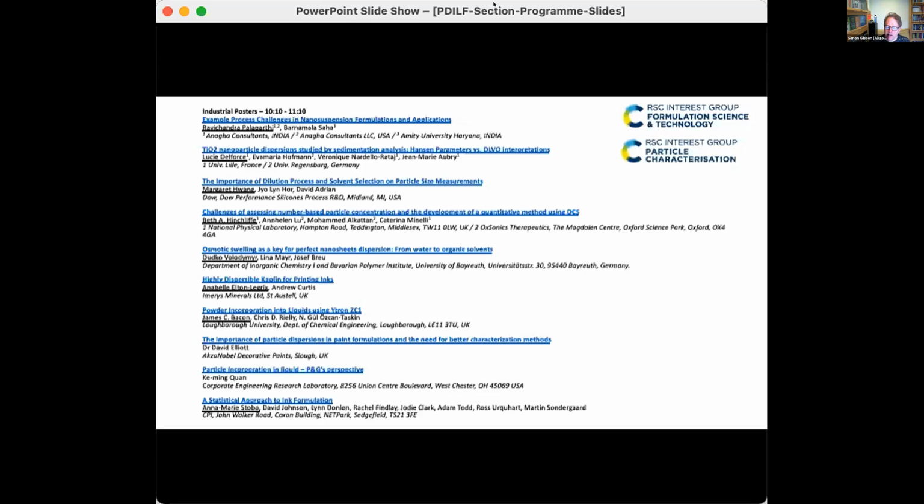Yeah, I can understand that a small number of particles of small size, which would show up in a number distribution, could have significant safety implications, which could be quite interesting. We managed to get a patent once where we stated that it had to have a number of particles below a certain size. All that meant is you just had to get the measurement better and better, and you could always find them. Not a very good example, but I can see it from a safety point of view.